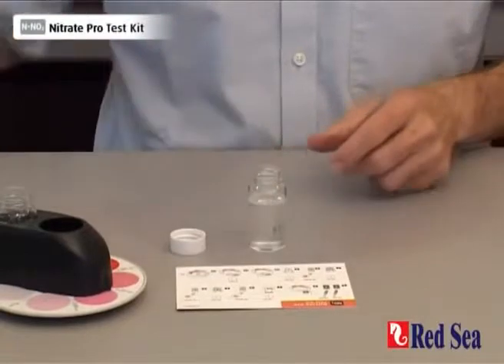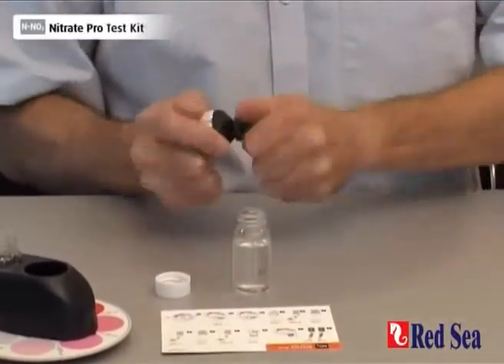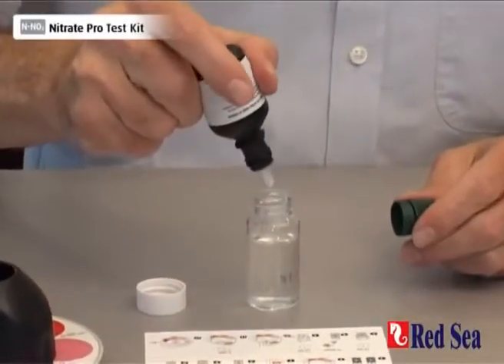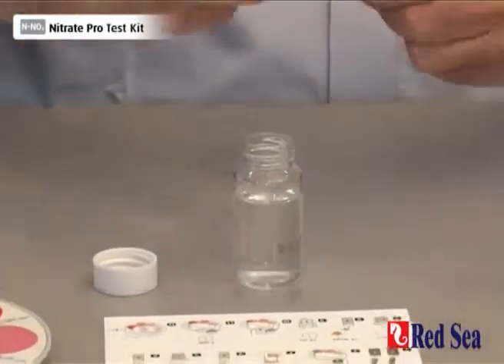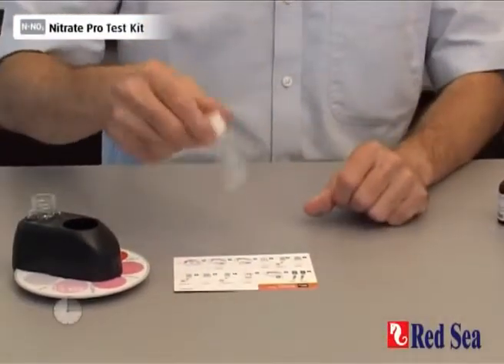We're now going to add five drops of Reagent B: one, two, three, four, five. And again, we have to shake well for 15 seconds.